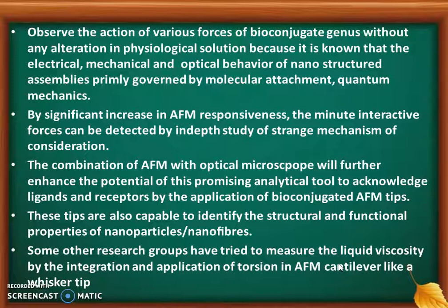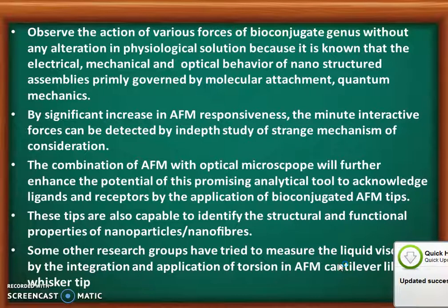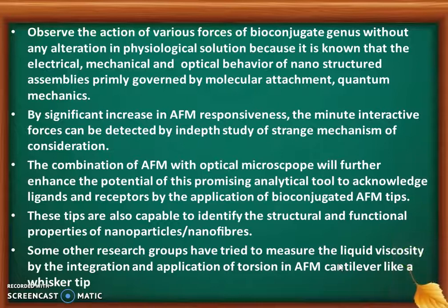By a significant increase in AFM responsiveness, minute interactive forces can be detected. By in-depth study of strength mechanisms, the combination of AFM with an optical microscope will further enhance the potential of this promising analytical tool to identify ligands and receptors by the application of bioconjugated AFM tips.